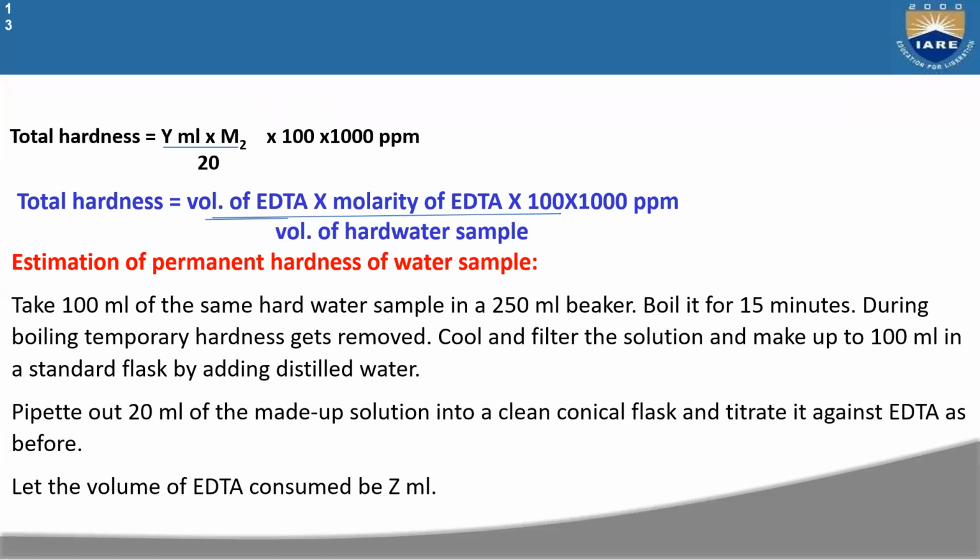We get the filtrate and the residue. Residue means the solid particles, and the remaining liquid we call filtrate. That filtrate we make up to 100 ml.